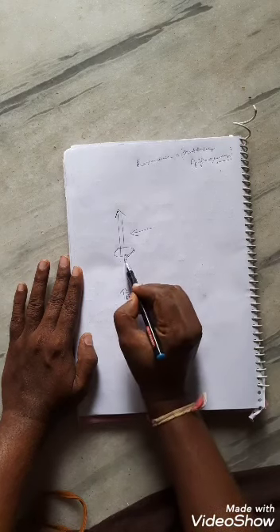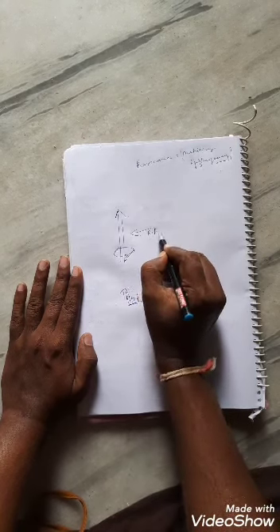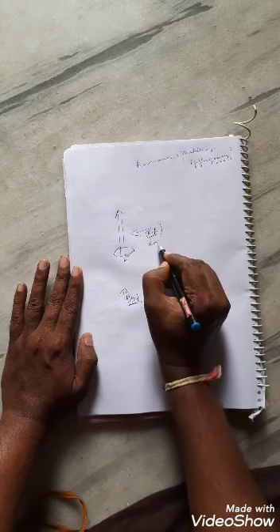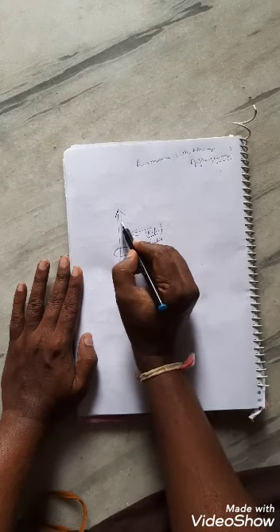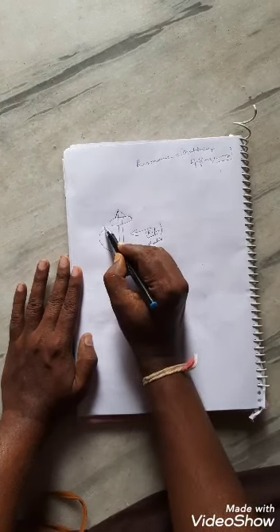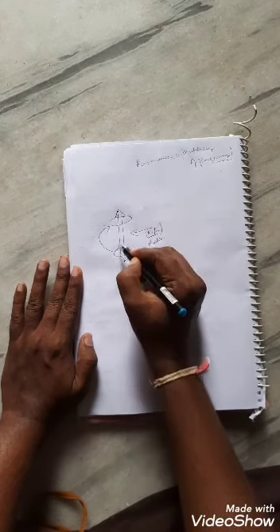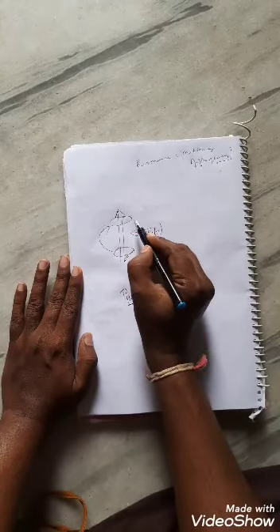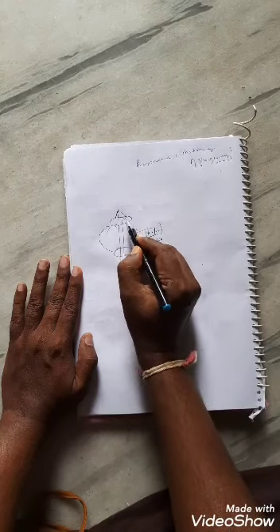So this nuclear magnet at resonance conditions receives radio energy, and it will flip to the higher energetic precession. So now it will rotate in the opposite direction.